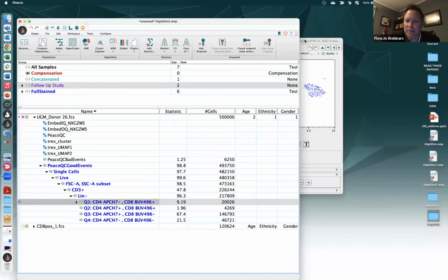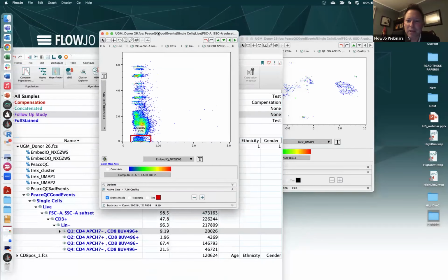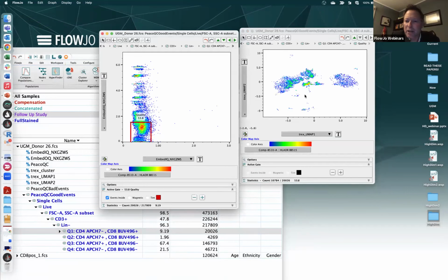If we then, and this is particularly an example where I picked something that had a bunch of different cells in it, you could include a higher percentage. Okay, so this population pops in here. This is probably some kind of cell that wasn't present in our example files that is in this new file. And so it's not really sure where to put it. And it ends up putting it sort of in between as a new population. So its output quality score is getting progressively worse. And it ends up there.